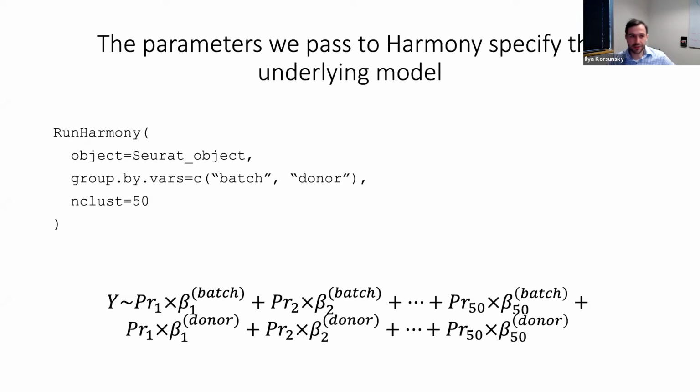So I guess there's 2 broad metrics for success. One metric is I've successfully mixed my cells, locally. And there, plotting is a great way if you have a small number of batches. If you have 3 to 5 batches, you can give each one a color and you can see if they're well mixed.